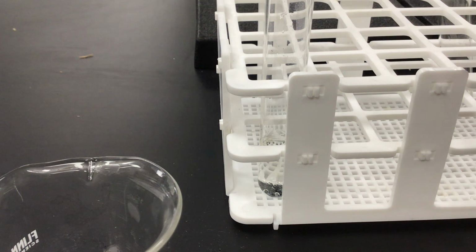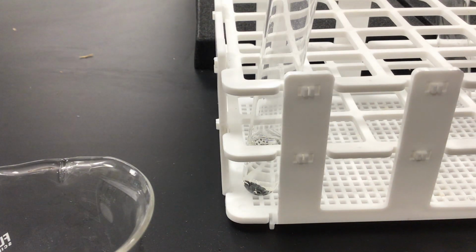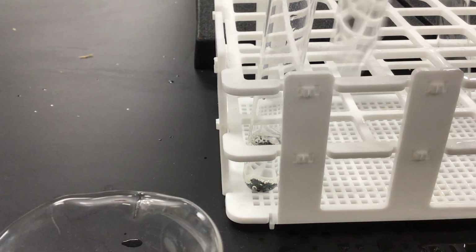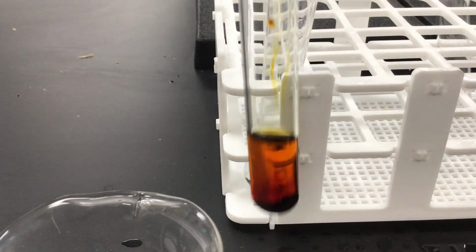We're now going to try ethanol. Ethanol, also a clear liquid. And I'm going to add a couple crystals of iodine. And when I do this, you can see that the liquid immediately turns brown.